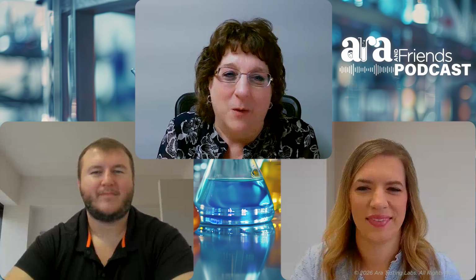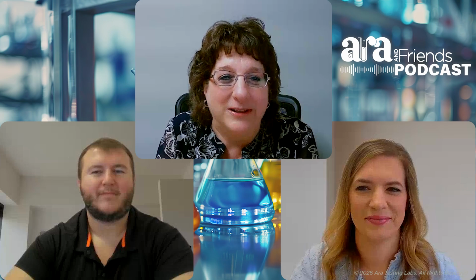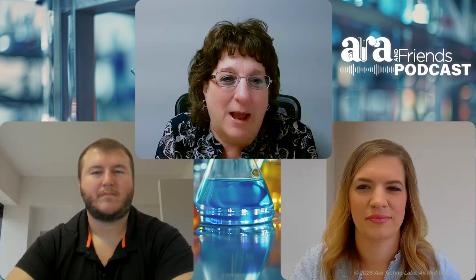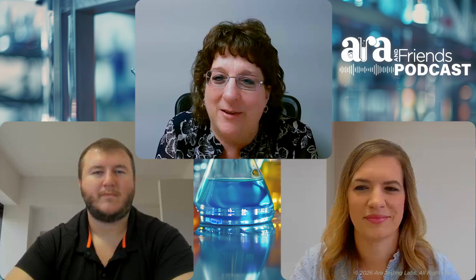And today we're going to be with our Ara team and we're going to go inside the lab. So at the beginning here, we're going to introduce everybody. We're going to talk about microbiology and we're kind of going to go back to the basics. So I'm going to let our team introduce themselves. Megan, let's start with you.